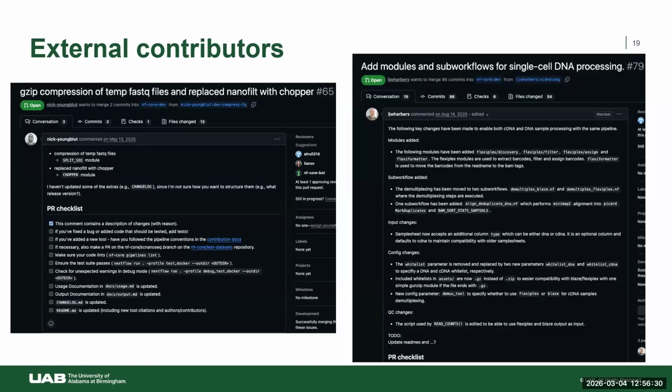Some methods don't work well with compressed data, so we do have to uncompress it as part of it. And someone actually made some suggestions on some steps in the workflow where we could swap a few things, which are new tools that have been released, as well as provide additional support for file compression. Because again, this will be just storage. And again, long-read data takes a lot of storage.